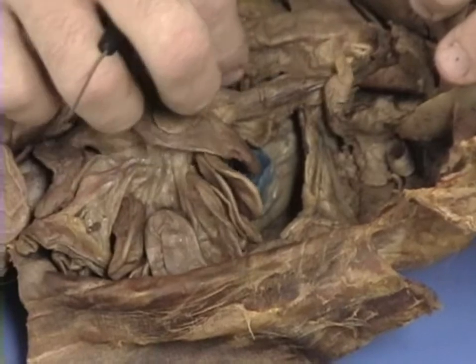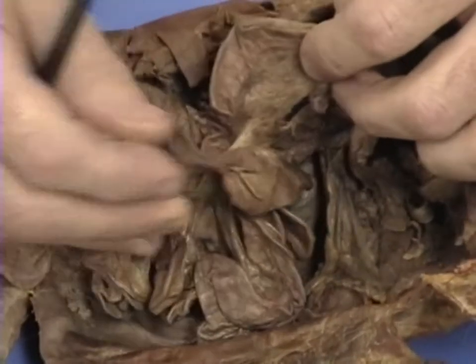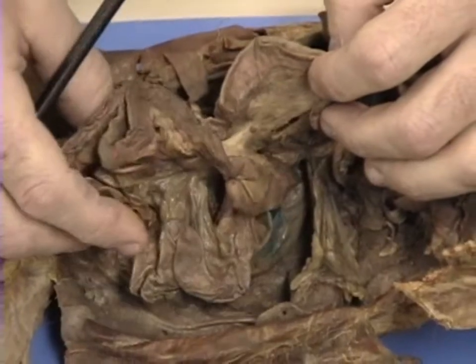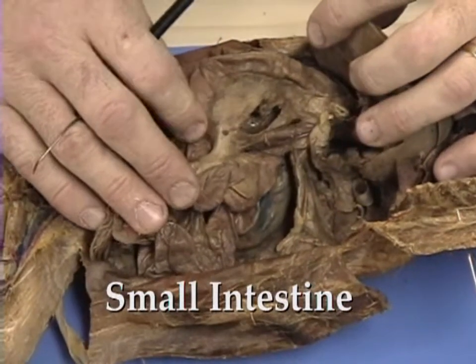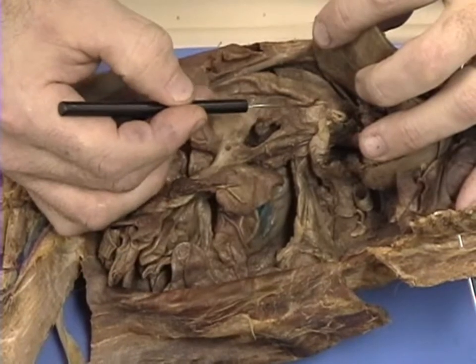A couple other things we'll notice, first of all, is we can start with the small intestine. Most of the abdominal cavity is filled with the small intestine, and that's what I have here in my fingers. The small intestine is broken up into several parts. The first part of the small intestine, I'll point to it here.